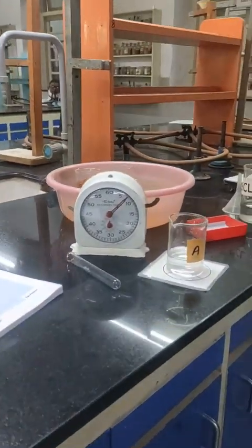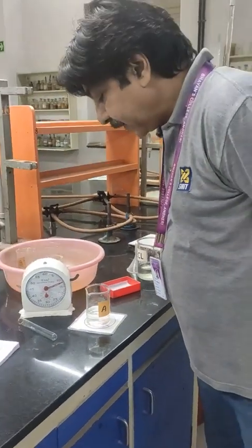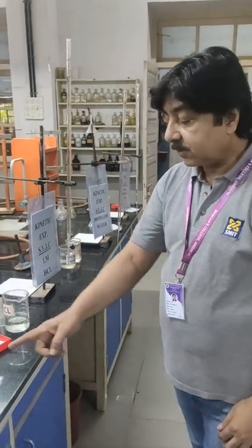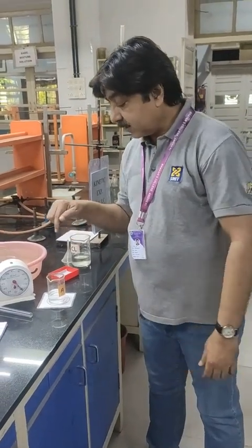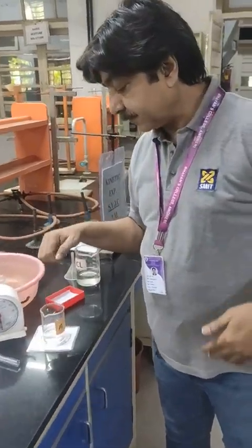And I will now observe the reaction which is happening in this container. As time passes, this clear and transparent solution will start becoming turbid due to the formation of colloidal sulfur, and the cross mark, which was distinctly seen, will become invisible.